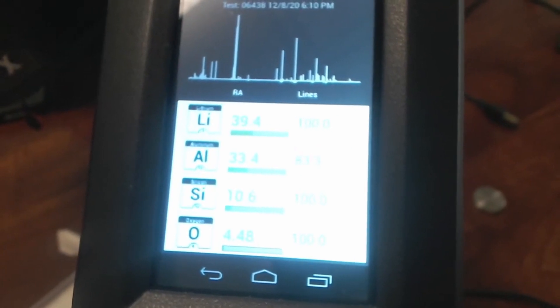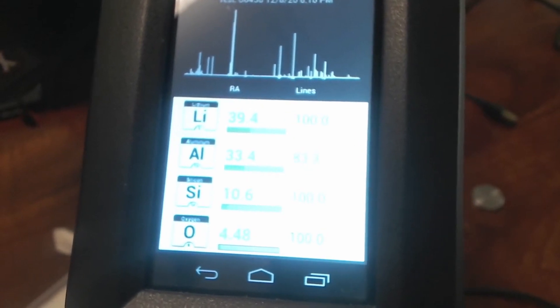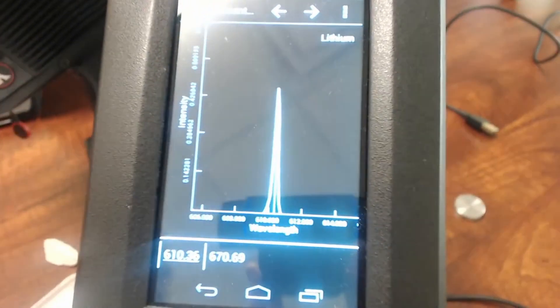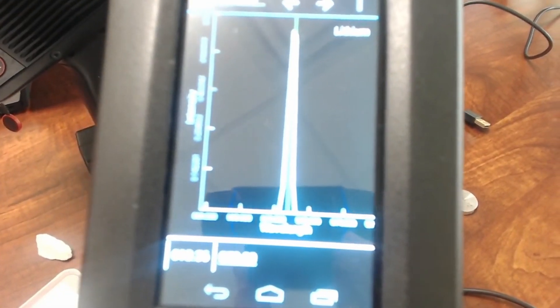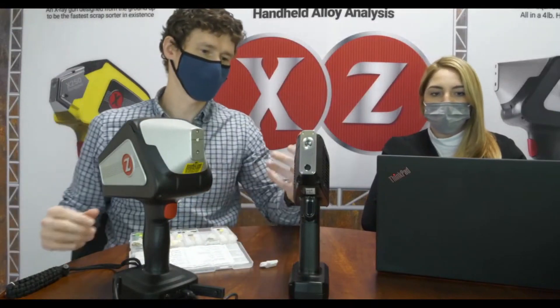If you're ever surprised to see lithium in a sample, you can tap on lithium and then tap on the spectrum to visually confirm it. There's the nice lithium line at 610 nanometers, and then here's the other strong lithium line up at 670 nanometers. It's a really easy way to get a quick qualitative analysis of your sample to understand what you're looking at, but not necessarily how much. Now I'm going to run a quick side-by-side experiment with the XRF to show you the differences.